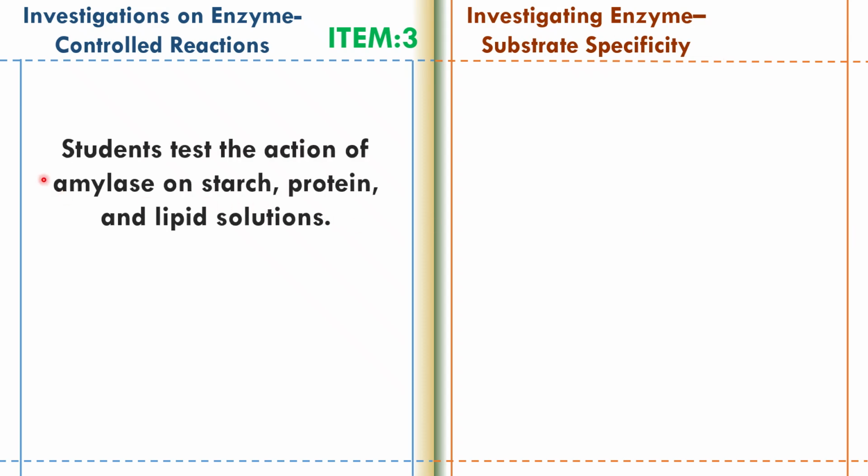Investigation on enzyme-controlled reaction. Item 3. We are going to investigate enzyme substrate specificity. Students test the action of amylase on starch, protein, and lipid solution.